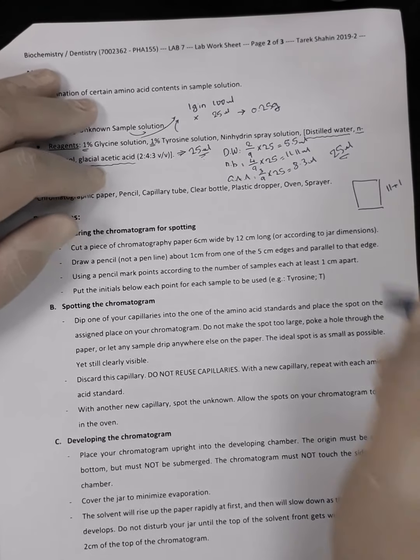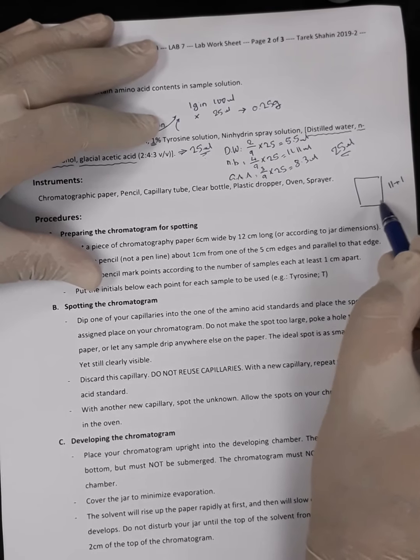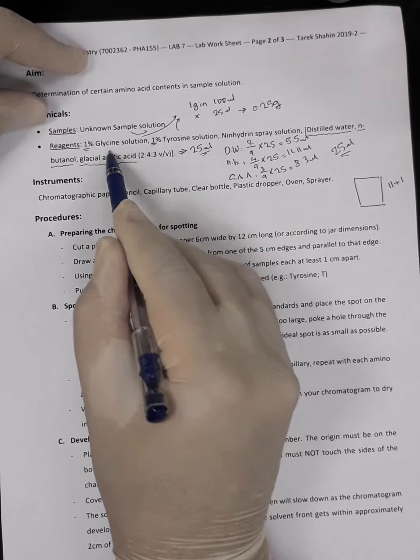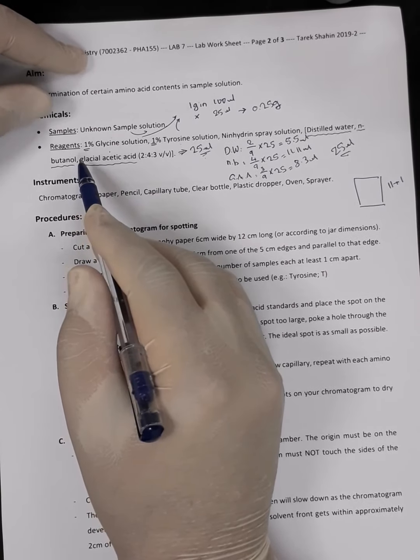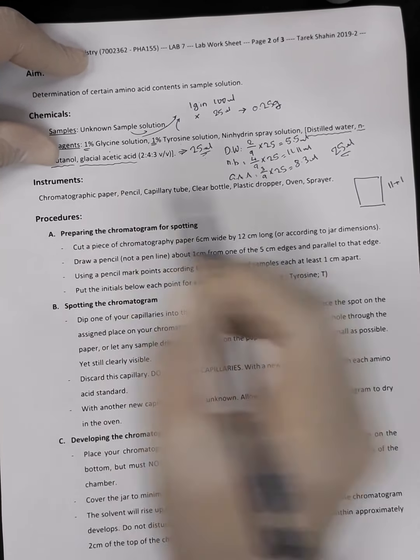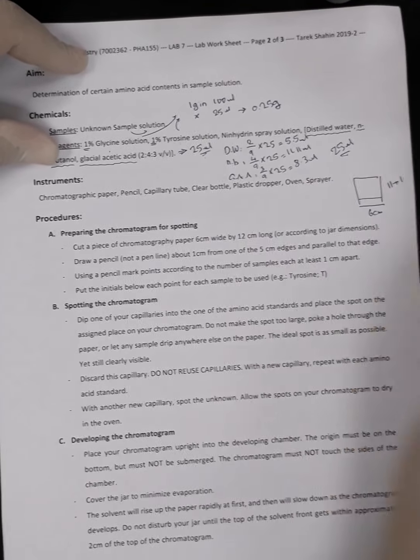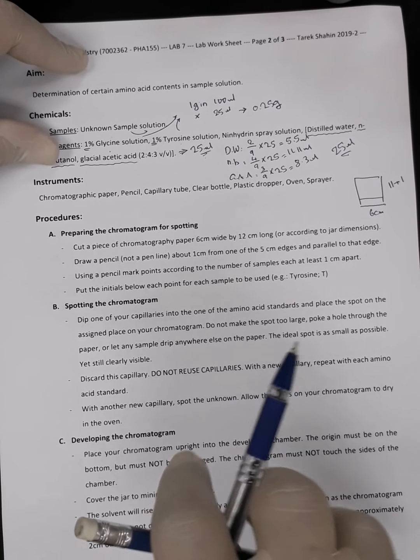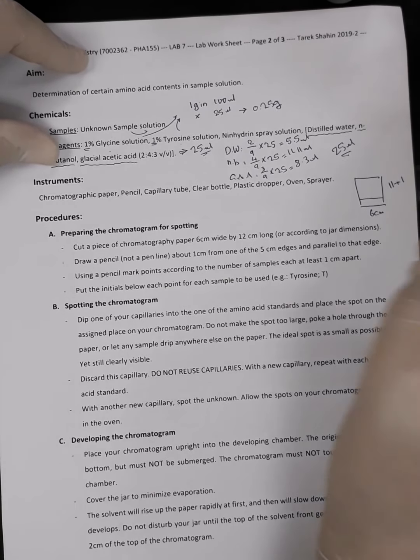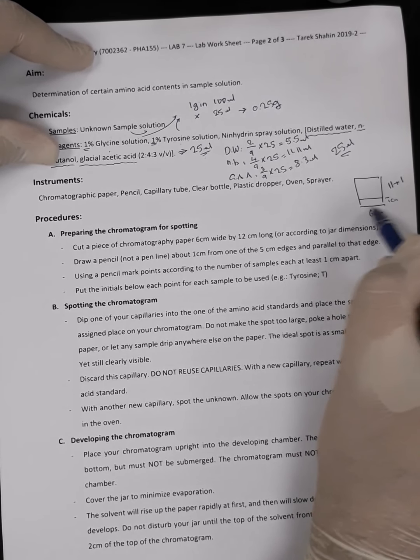Next, we have to specify the width of that paper. How to specify the width of the paper? We need how many standards? 1 and 2. And we have 1 sample. So the total number of spots is 3. If you multiply 3 spots by 2, it is 6. So 6 centimeter, this is the width of the paper. We have to draw this using pencil only. Ink is not allowed, so we use only the pencil. And we will draw the start line 1 centimeter from the bottom of the chromatographic paper.